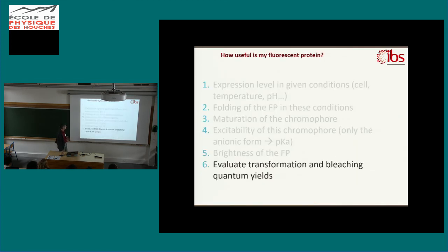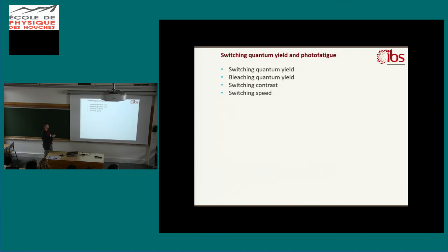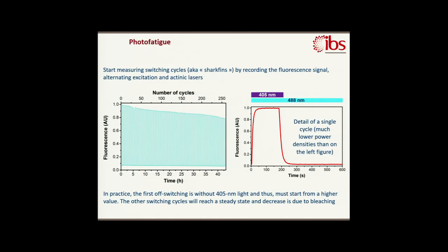And the last is to evaluate the phototransformation bleaching quantum yields. So in fact, you can estimate all these: quantum yield switching, switching speed, and switching contrast, with only one good measurement, which is the photofatigue. If you have a fluorescent protein that is reversibly switchable, obviously, you make photofatigue cycles like that.